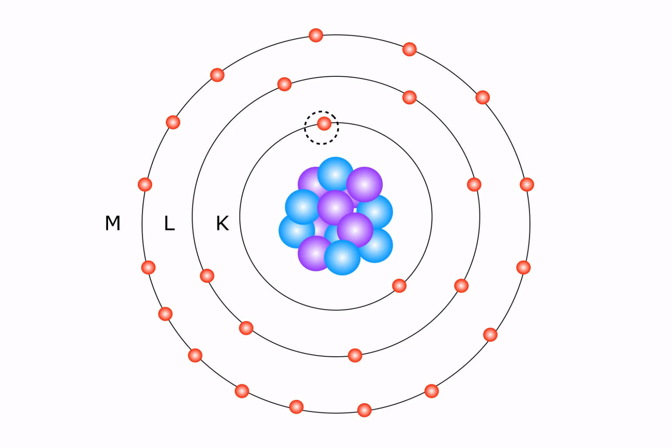Now, one way I like to think about photons is they are a lot like a currency for electrons. The way to think about this is actually Apple. I'm a big Apple fan. In fact, I'm recording this on a Mac. As a consequence, whenever Apple releases a new product, I typically pull out my wallet and say, take my money. My money are the photons, and I am an electron who's awfully excited and ready to jump down to a lower energy state, which would be an emptier wallet, but hopefully with an iPad or an iPhone. Now, in this case, the photons are the currency of energy.